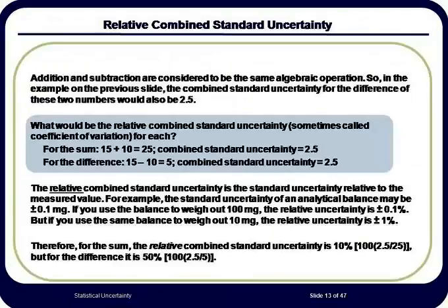Relative uncertainty is a measure of analytical precision. Whenever possible, we would like to have a low percentage for this value. The concept of relative combined standard uncertainty shown here identifies how the overall method of computation of the output estimate affects the relative combined standard uncertainty and emphasizes that each uncertainty measurement can have a significant effect on the analytical precision.